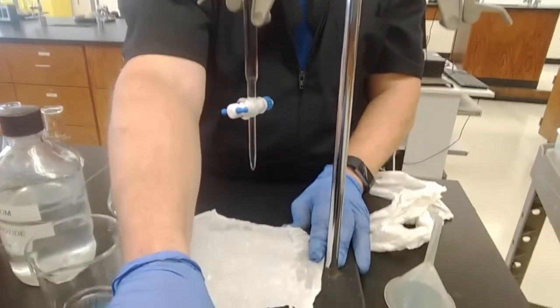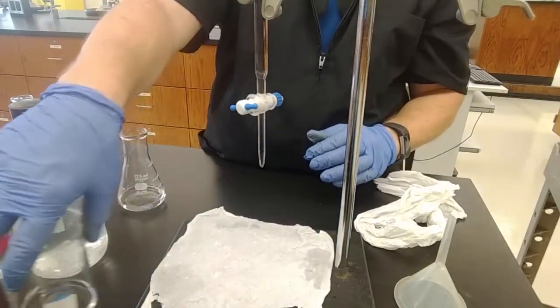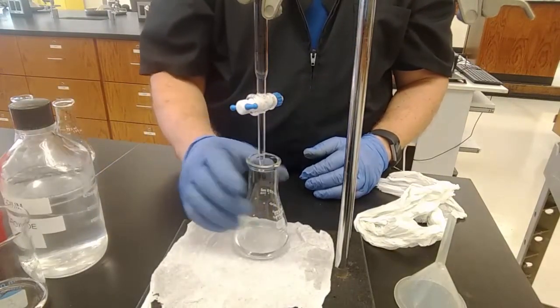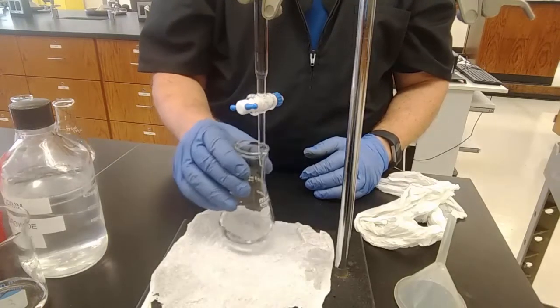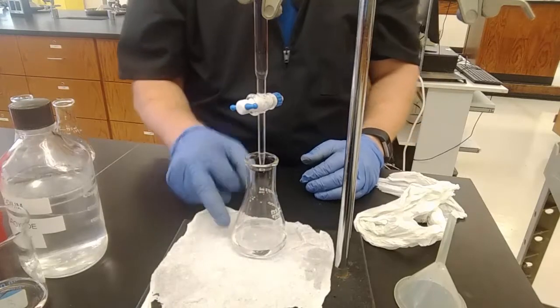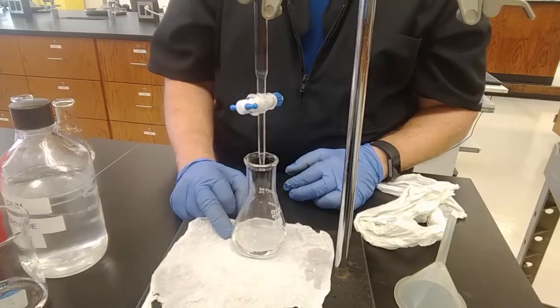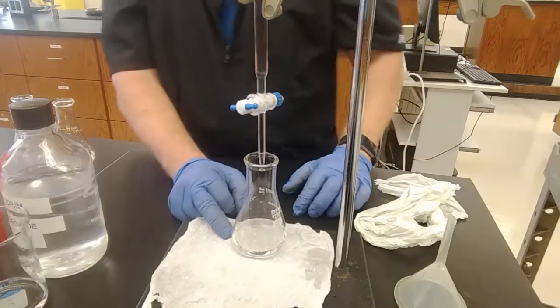Move this closer where you can see it. See all the action. First flask, underneath. Notice the tip is into the flask so that as I'm swirling it around, I don't accidentally miss a drop. Now you could put a stirring bar in here and put this on top of a magnetic stirrer and have it stir for you, but let's go old school.